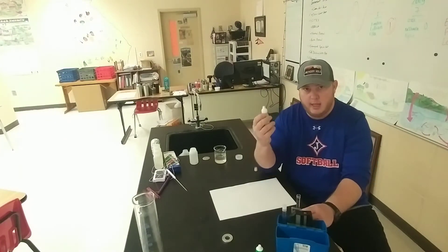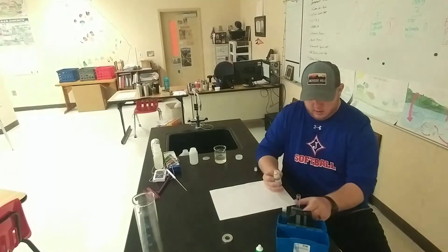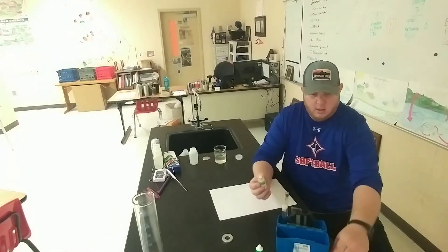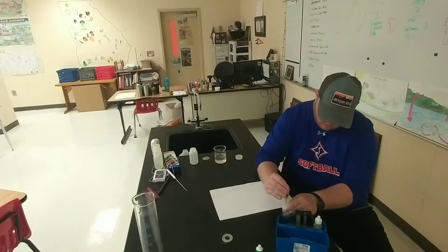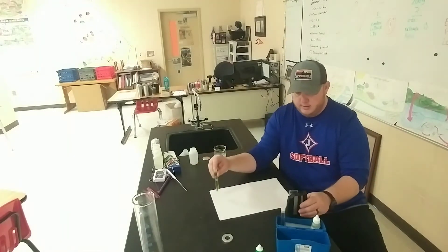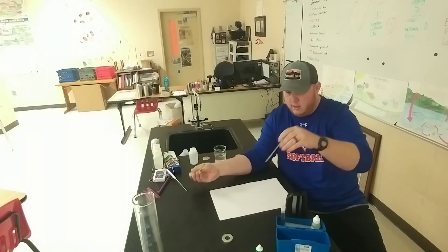The next thing we want to do is take our indicator solution. It says to add 10 drops of indicator in here, so carefully — one, two, three, four, five, six, seven, eight, nine, ten — ten drops, all good. Cap it and then mix it, just give it a couple of twirls.